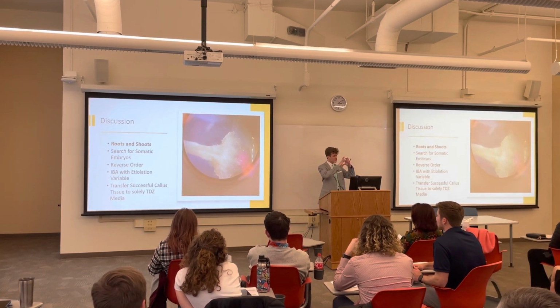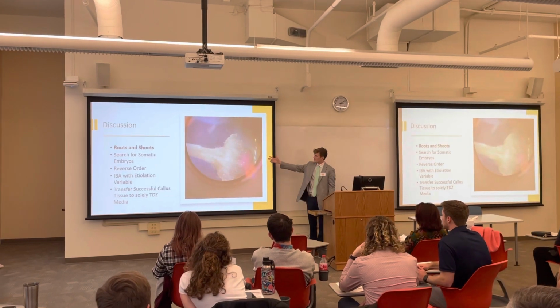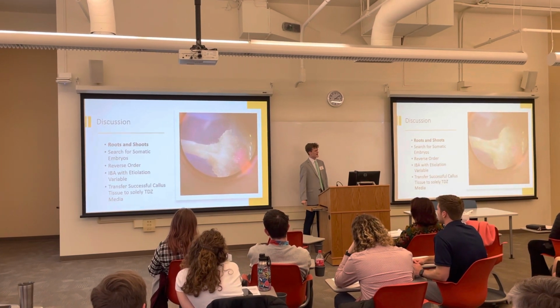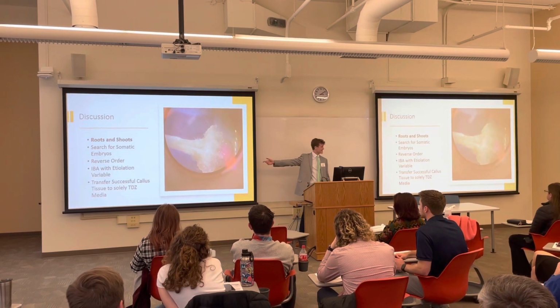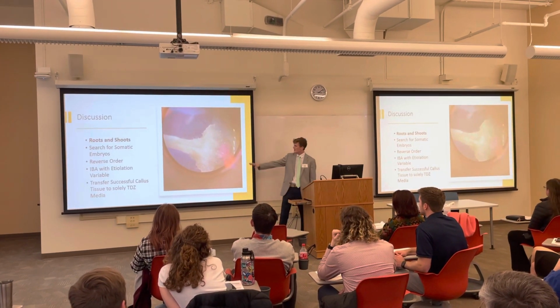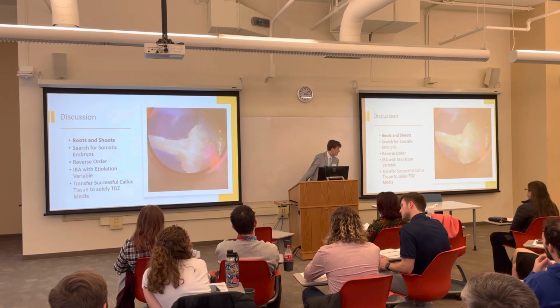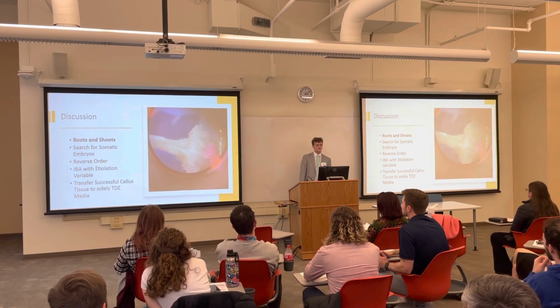Next, we're searching for somatic embryos. Those little heart-shaped things that I told you earlier, where they form the shoots, you can only find them under a microscope. I've got something like 90 samples in my lab right now with callus tissue. I'm going to have to go through each of them and try to look at them under a microscope and find a very tiny little heart-shaped thing on this glob of callus tissue. But if we can find that, we have hope. Because if we have somatic embryos, we get shoots, we get those new plant organ developments.